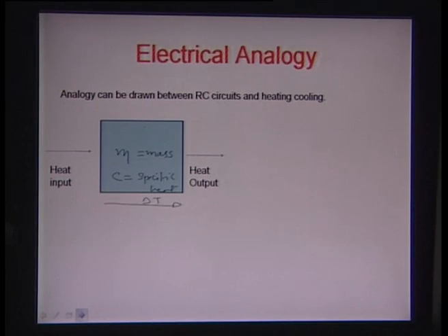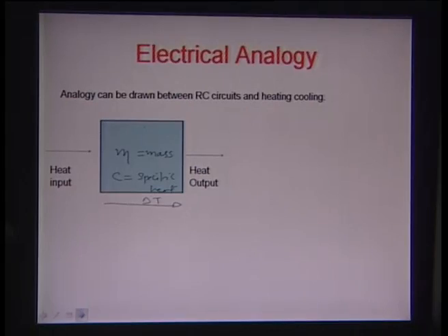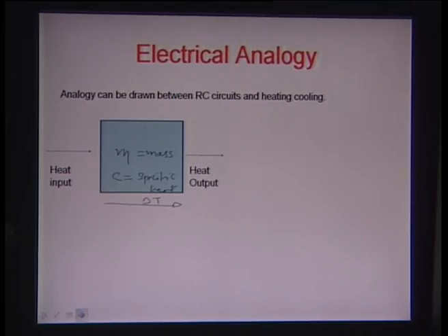One interesting factor which comes into the picture while designing PCR chips is how you will characterize the chips thermally, and what you need to do to ascertain how much time it would take for the chip to cycle to a certain temperature. So let us draw some kind of an electrical analog for these kinds of problems. We consider any thermal system to be a bunch of resistances and capacitances in circuits. So let us draw this analogy one by one.